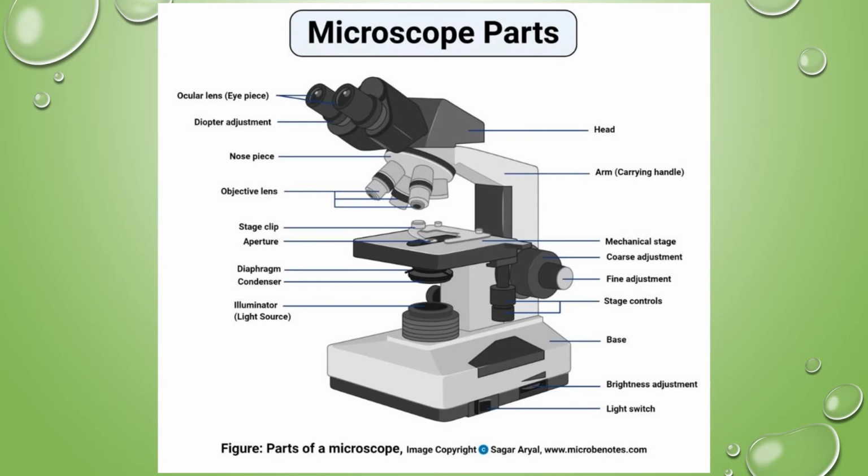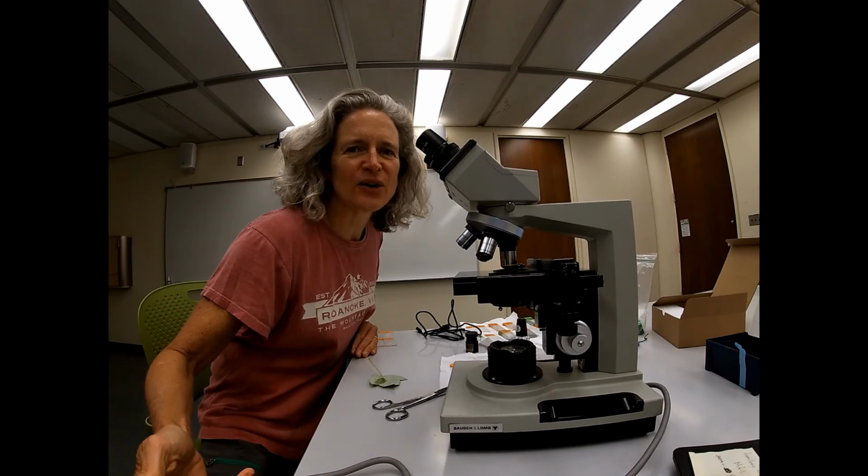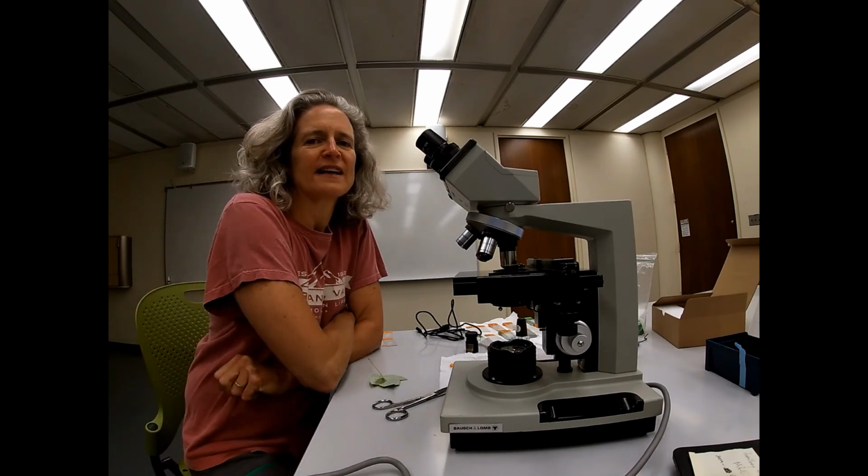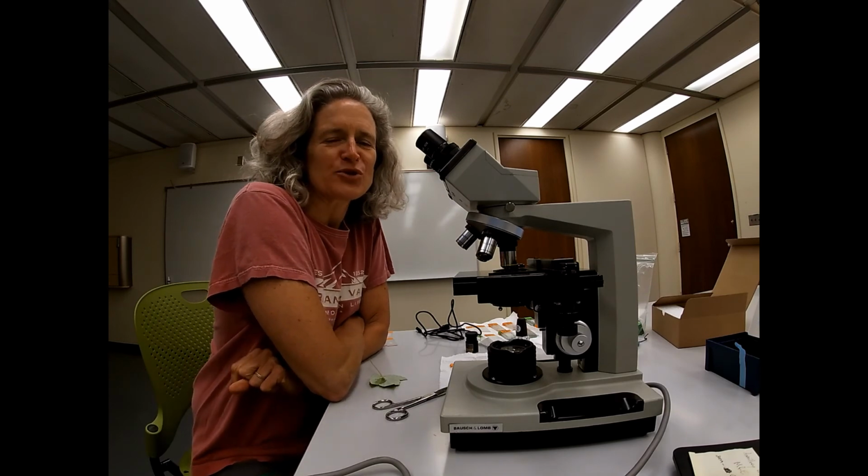What I want to do with you here is really just talk to you about using a microscope. So here's a diagram that shows you the parts of a microscope, and following is a YouTube video that I put together to explain using a microscope. Okay, hello, and welcome to Ecology Lab, where we're going to think a little bit about microscopes.